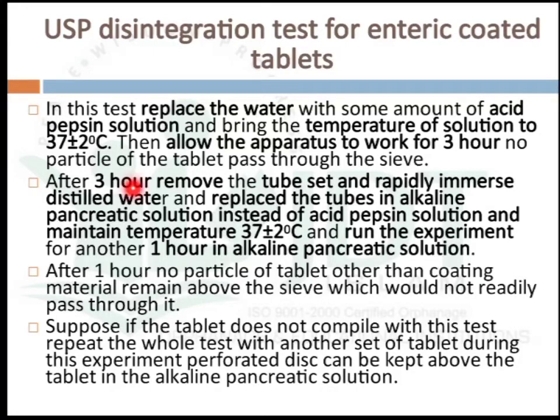After 3 hours we remove the tube set, rapidly immerse it in distilled water, and replace the tube in alkaline pancreatic solution instead of acid pepsin solution, again maintaining the temperature at 37 plus or minus 2 degrees Celsius, and run the experiment for another 1 hour. After 1 hour, no particle of the tablet other than the coating material should remain above the sieve, which would not readily pass through it.